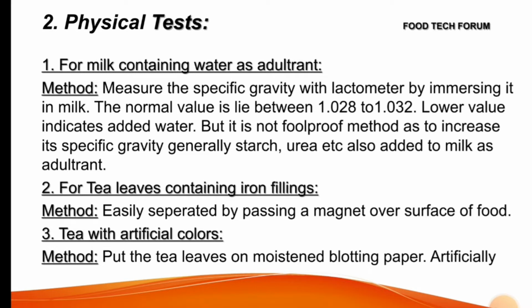if there is any presence of white precipitate on the glass plate, that means it is pure milk. While milk which contains water will flow without leaving any white precipitate. So that is the common method everyone knows. Second one is using the lactometer, where we simply measure the specific gravity using a lactometer.